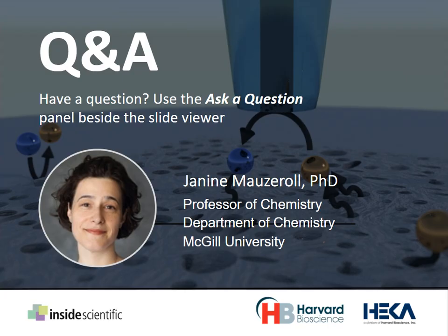So the first question here, what are the similarities to SVET? So I think that's scanning vibrating electrode technique. Yes, so SVET measures, first of all, it's oscillating, right? And it also measures the difference. It sometimes has two wires. And SVET is also very useful in corrosion. So I would say it's like a complementary technique. Like most SECM instruments could be adapted to do SVET as well. It wouldn't be that difficult.